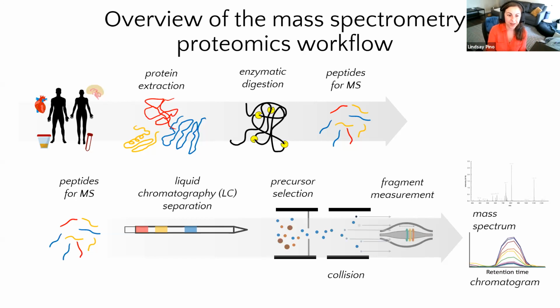So this is actually a really long workflow compared to a lot of other protocols in biology and biomedical research. This is a pretty intensive workflow, and we don't have the luxury that genomics workflows have of just amplifying our analyte. We can't just amplify the protein to get more of it.